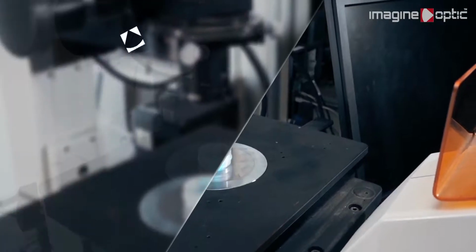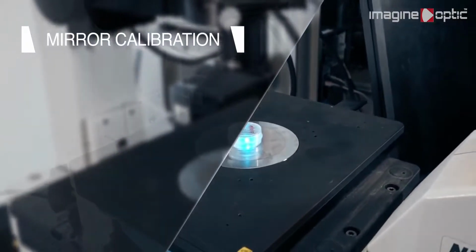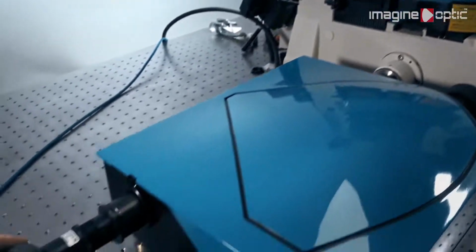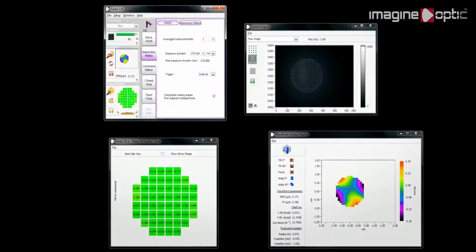Once MicAO is aligned, we calibrate the deformable mirror using a 1 micron fluorescent bead at the surface of the coverslip as a point source to measure the wavefront using the wavefront imager on the camera port of MicAO. During this step, each actuator on the deformable mirror goes through a push-pull cycle, and each corresponding wavefront is recorded.